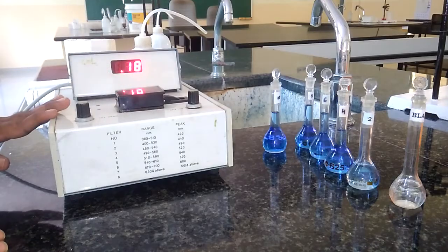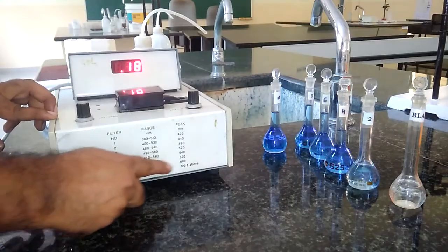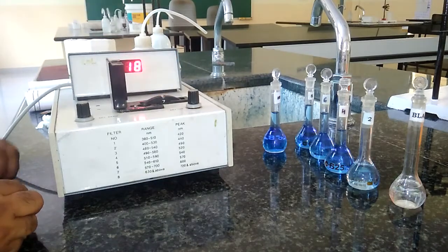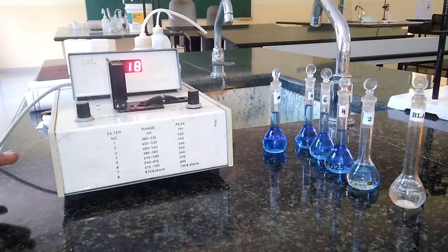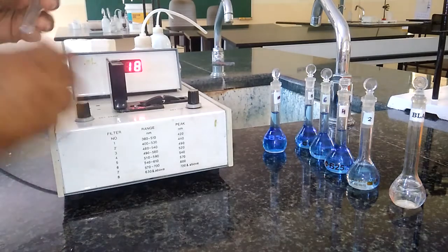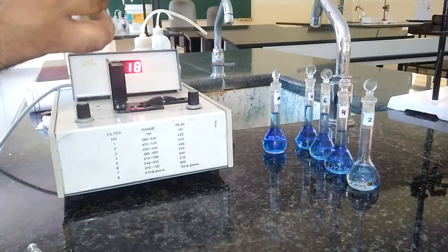We have to set the wavelength to 620 nanometers. Here we can see the different filters. At filter number 7, we have 620 nanometers. It is already adjusted — filter number 7 gives 620 nanometers because at 620 nanometers, copper will give the maximum absorbance. That is why 620 nanometers is selected for copper estimation in colorimetry. The first thing is we have to set the absorbance to 0 by taking this blank solution.